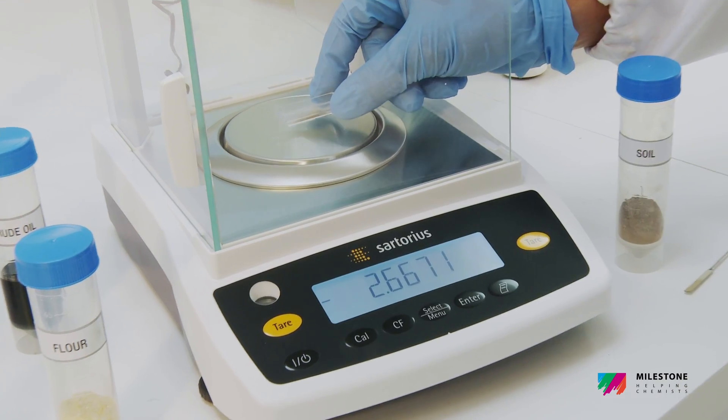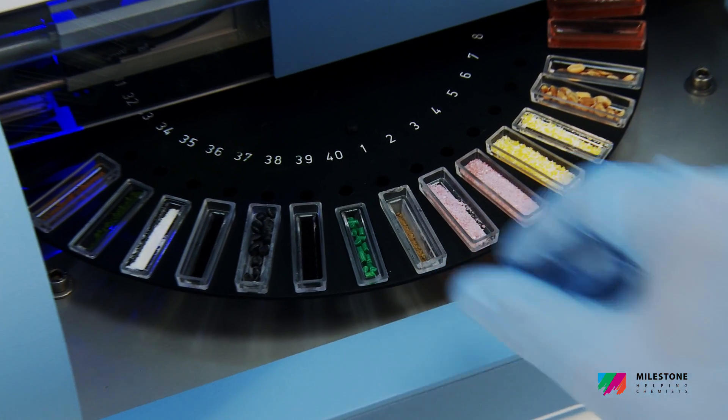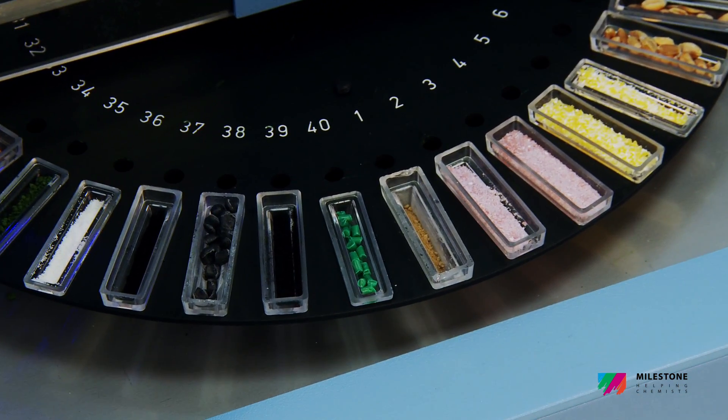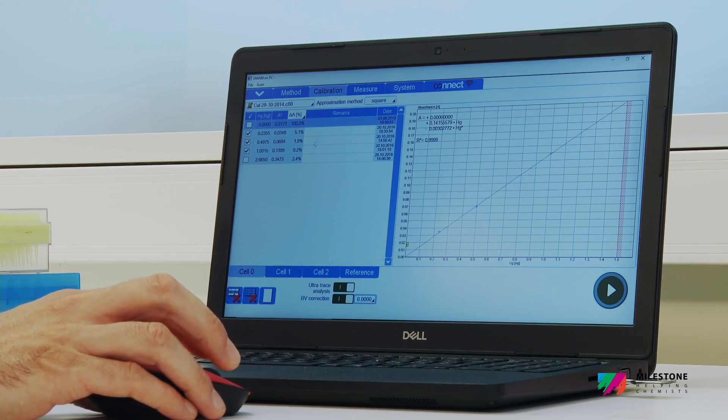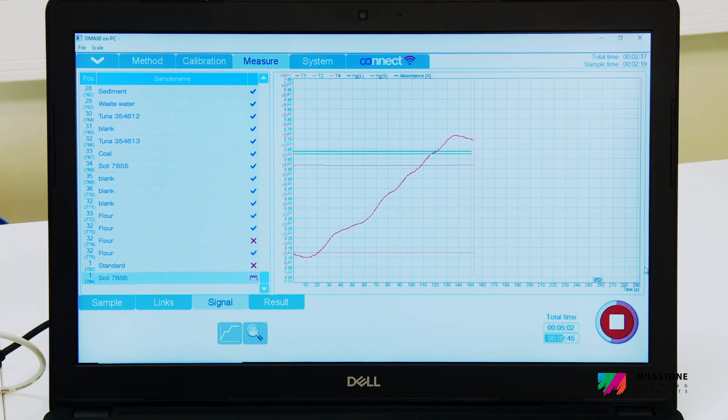Samples are directly weighed in a boat and placed in the 40-positioned auto-sampler to begin the analysis. A long-lasting calibration done with liquid or solid reference materials is suitable for any type of sample.